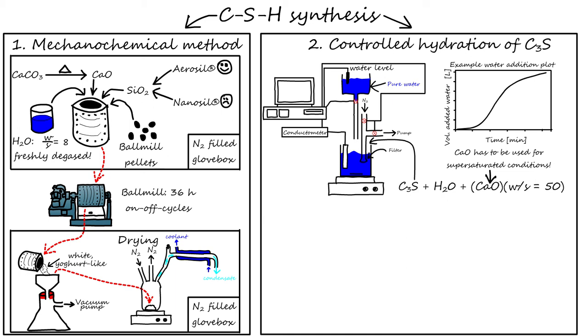3 series were carried out. In series 1, the lime concentration was varied between 12 and 28 mmol per liter. The reaction was stopped twice, once during the acceleration period as shown and once during the deceleration period. The CSH and the morphology were then investigated.